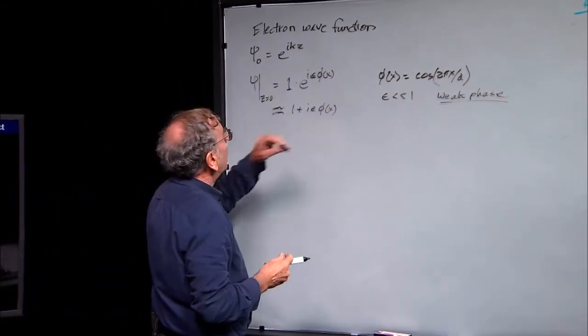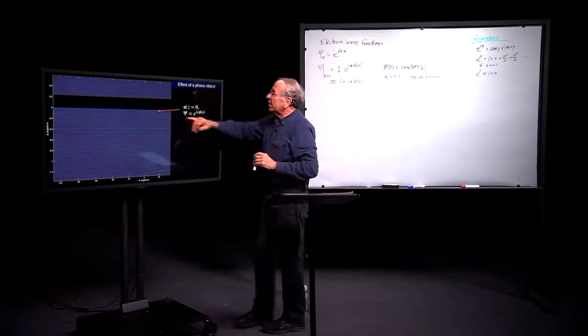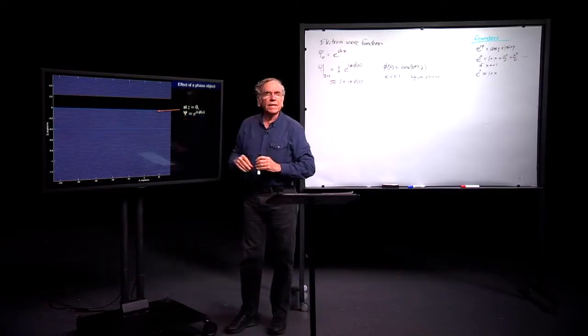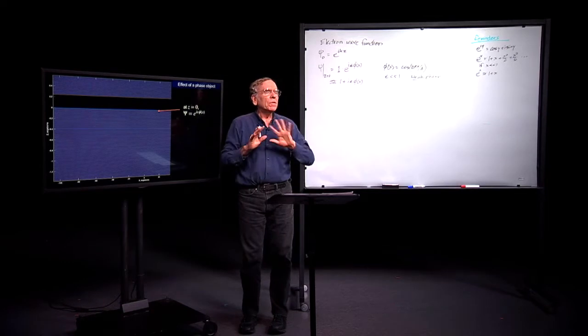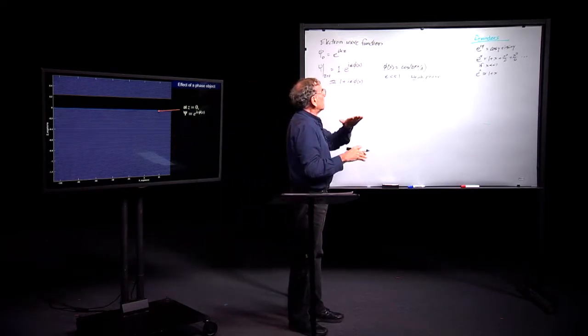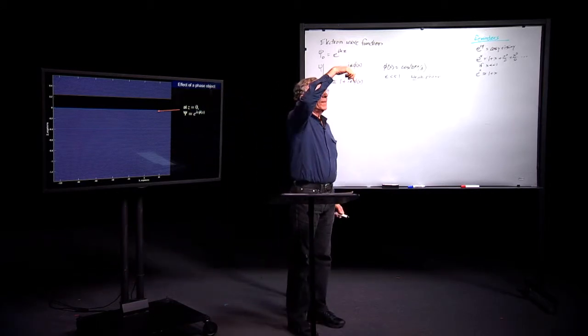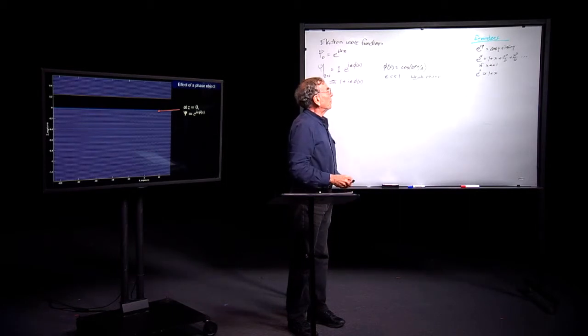Okay, so that's what's happening right at the level of the specimen, right where I've set z equals 0. But what's going to happen at places below the specimen? I have z increasing in this direction because I'm thinking about electrons falling vertically through the microscope.